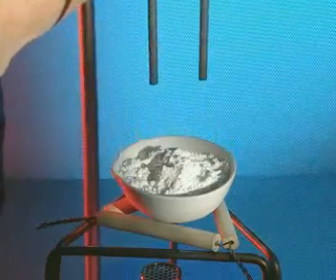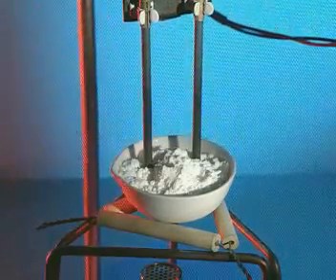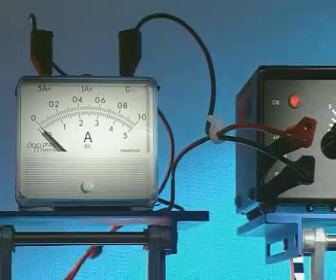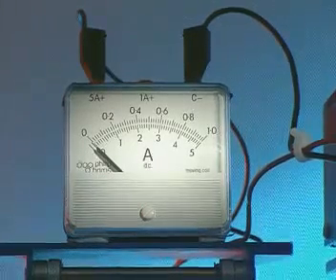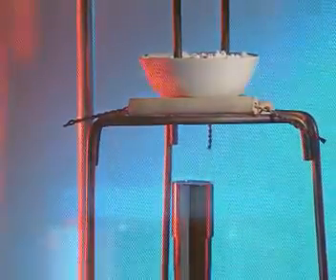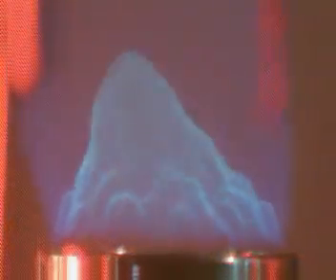The white powder is lead bromide. Switch on the power supply and nothing happens. The ammeter reads 0. Solid lead bromide doesn't conduct electricity. It needs to be molten. Lead bromide melts at 370 degrees Celsius.